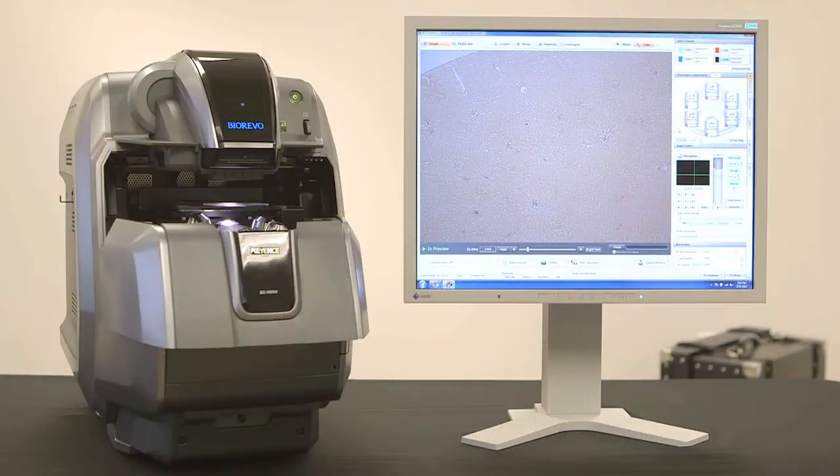Looking at the screen, this is the easy-to-use viewing software. As you may have noticed, there are no knobs on the microscope.